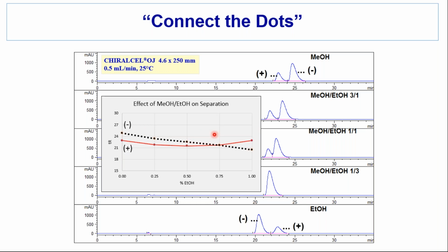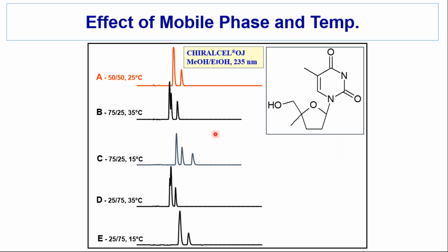So I think it's worth plotting the data, and it's worth having not just one or two data points, but a data set to make sure that you see what the nuanced behavior is. In this case, it's trivial. It's fairly easy to visualize, and maybe not worth a big study, but still have the ideas. But if we go to something a little more complicated, then we probably want to do a more sophisticated study.